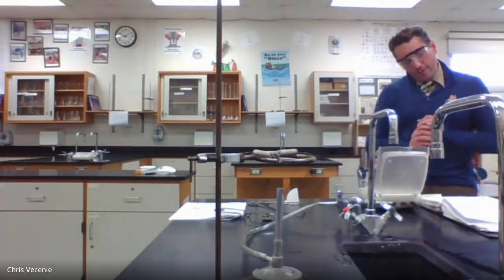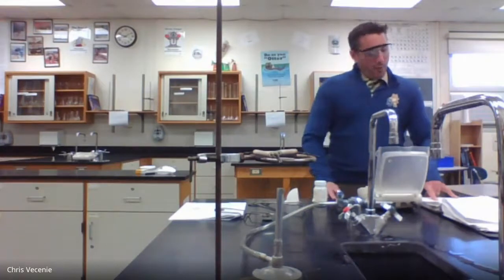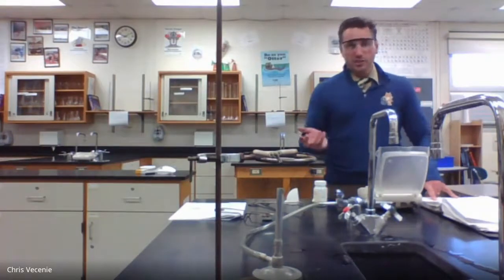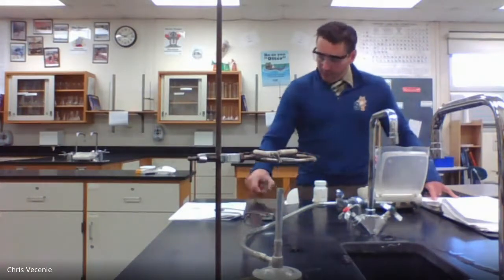So this 10.73 is now reading 13.11. So your very top line of your table is 13.11. I overshot just a little bit, but it's not a big deal. We just wanted a ballpark of 2. Then it tells me, okay, record that number. So make sure you have your 13.11 in the top line of your data table.